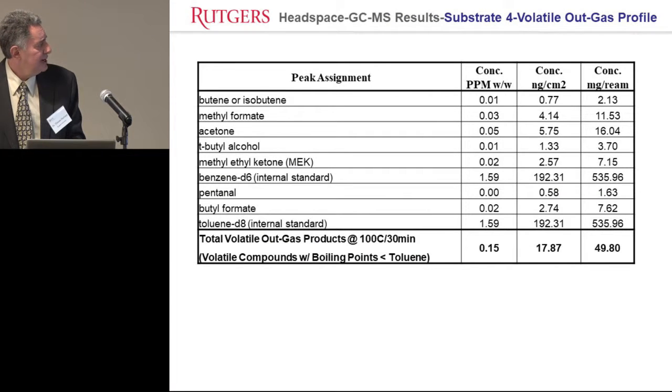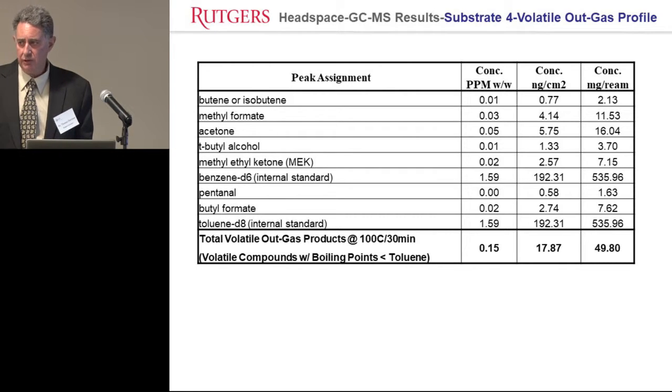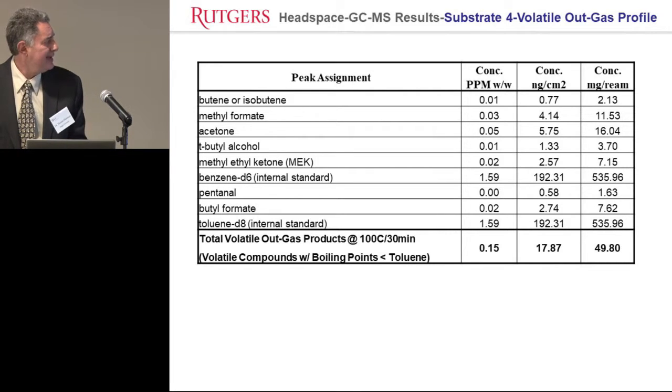I'm just passing this up. Volatiles are very low in cans because they're made by stoving. They spray the coating inside, then they bake them out in an oven in a process called stoving. So you don't get much in the way of solvents, maybe a tiny trace. The spectrum of this was not in any library, so we had to interpret the spectra and hypothesize that it was that compound. Then we bought a standard, ran it, and confirmed. And this is high-res confirmation that it matches the elemental composition. So that's the spectrum of the new monomer.